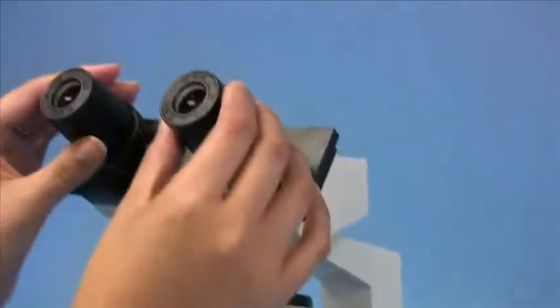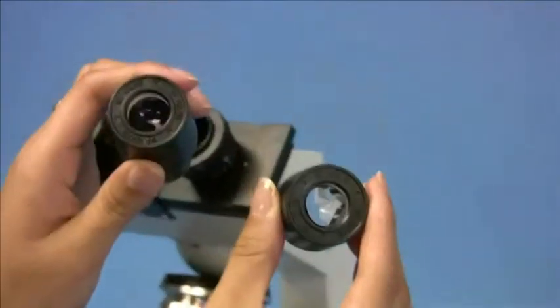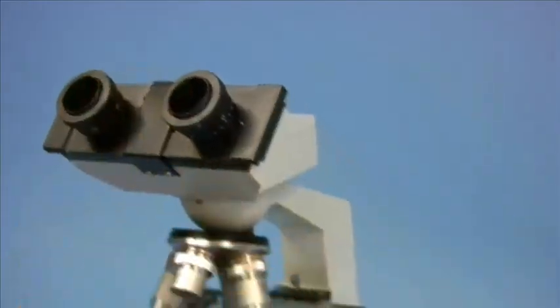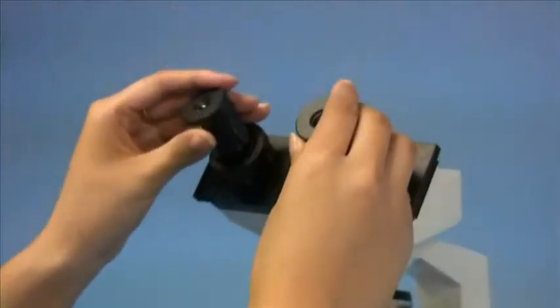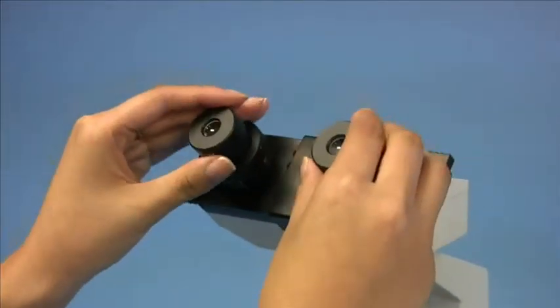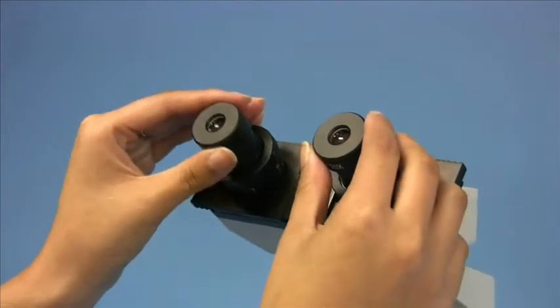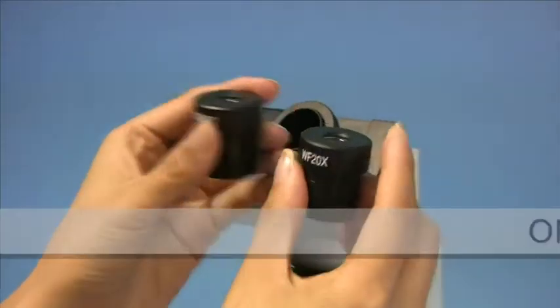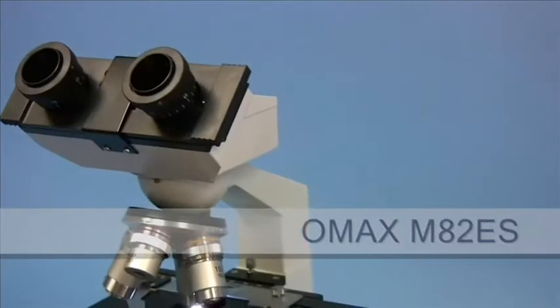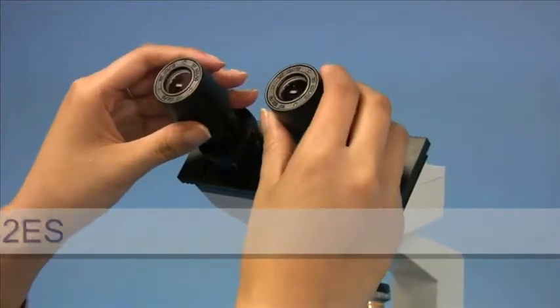The eyepieces also come in two sets, the 10 times, and the 20 times. As you can see, they can be changed very easily.